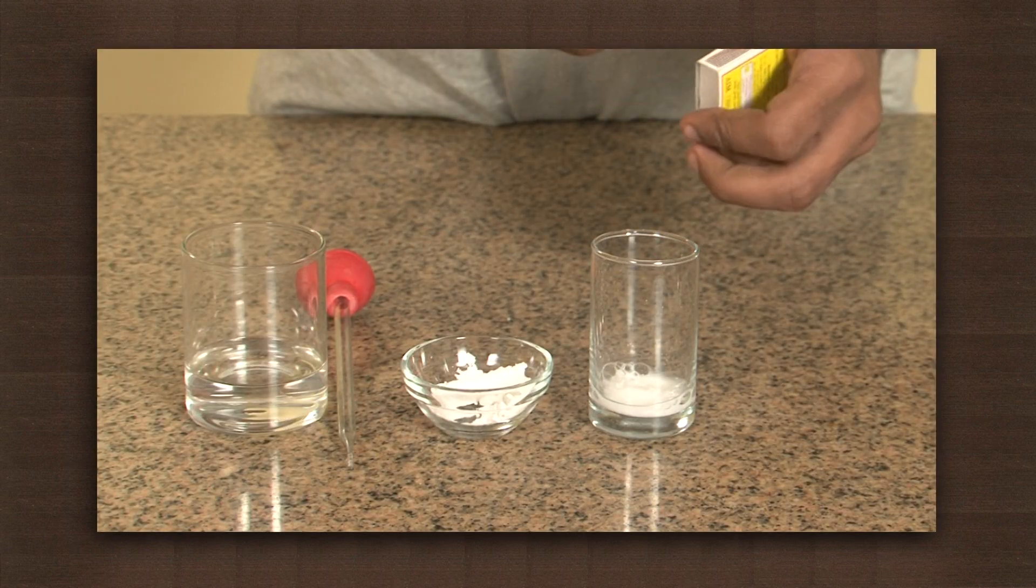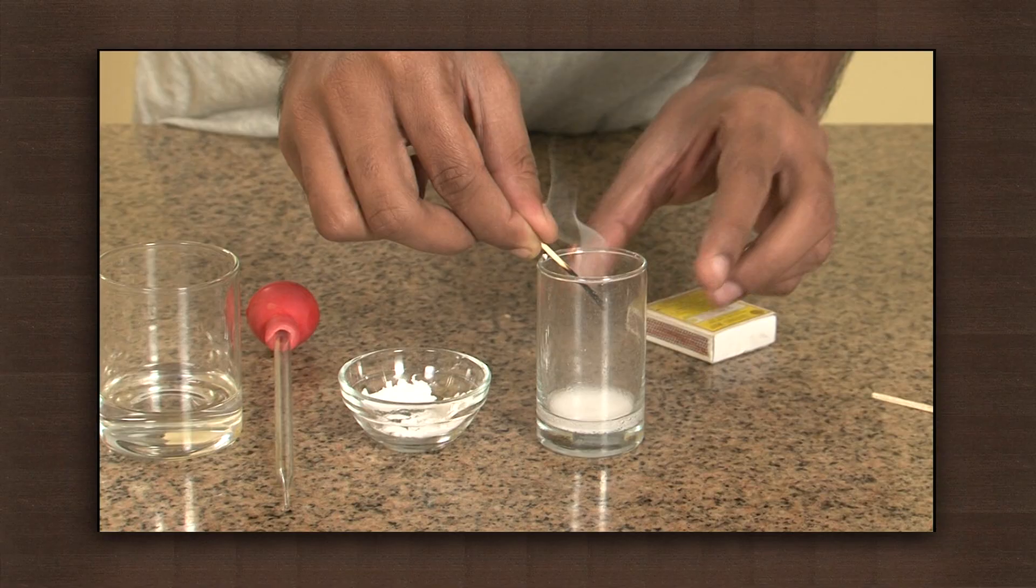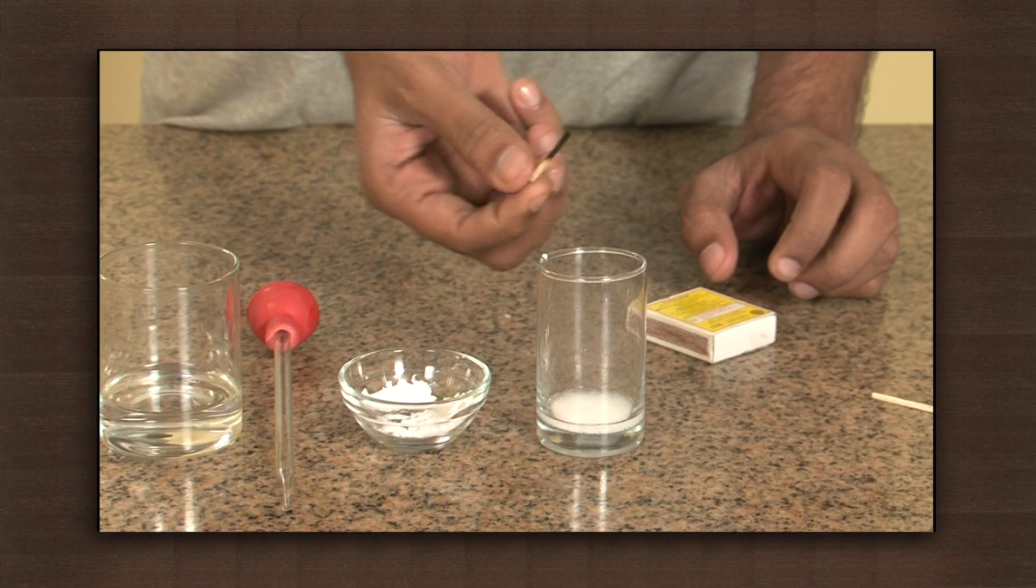Light the match and bring it close to the mouth of the beaker, and it extinguishes. This gas is carbon dioxide.